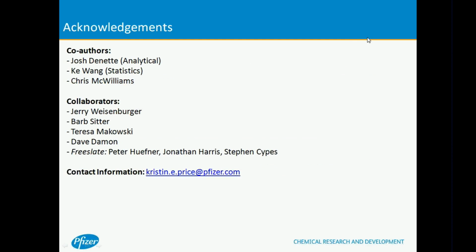Well, there's a few different limitations. The first one, of course, is that the software right now is limited to taking a single sample from 48 reactions only. And this is a programmatic limitation. This was our first pass at the feedback loop design on both our part and Freeslate's part. And so this can potentially be fixed to allow for more samples and more reactions with changes to the programming.